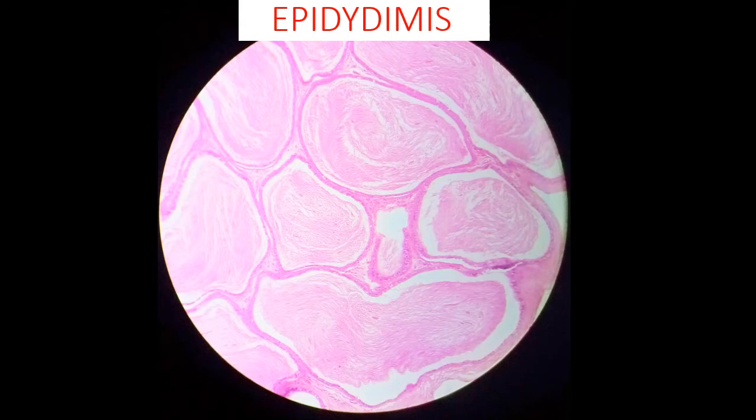Then moving to the epididymis. Epididymis identification is also very easy. We can identify a pale colored area at the center. At the peripheral area, we can identify a thick rim-like structure. If you observe that, we can identify it is lined by pseudostratified columnar epithelia. And the lumen is filled with sperms. The seminiferous tubules, all the tubules, connect with each other and form the epididymis. In the testis, we can see the spermatozoa and the entire lumen part consisting of mature spermatozoa. Only spermatozoa can be seen in the epididymis, whereas in the testis, we can identify spermatids, primary spermatocytes, secondary spermatocytes. But here in the epididymis, strictly the spermatozoa can be seen in the lumen. Okay, so that is about the epididymis.